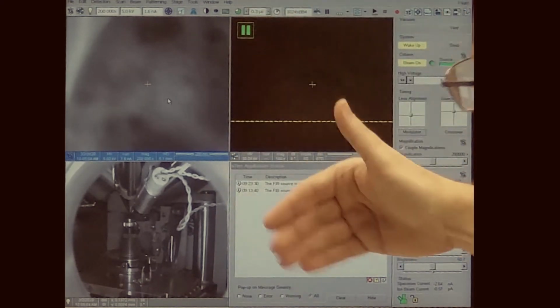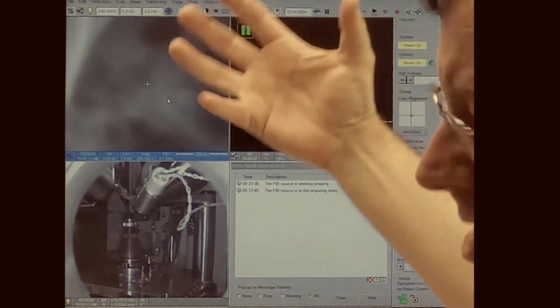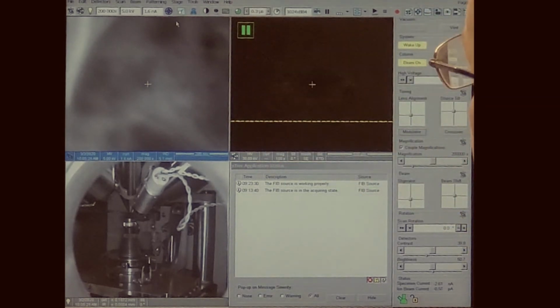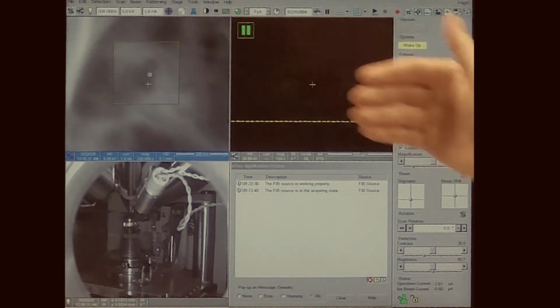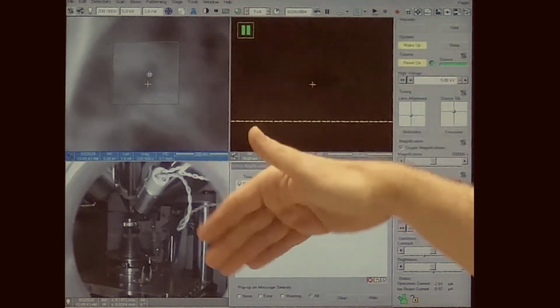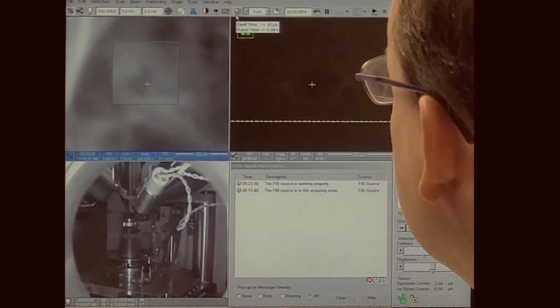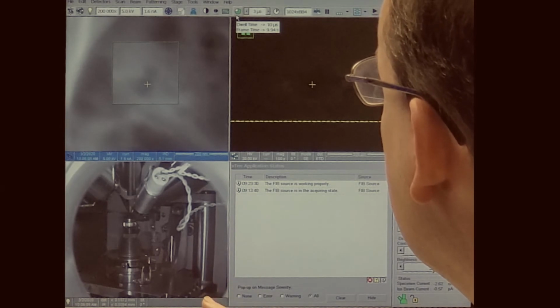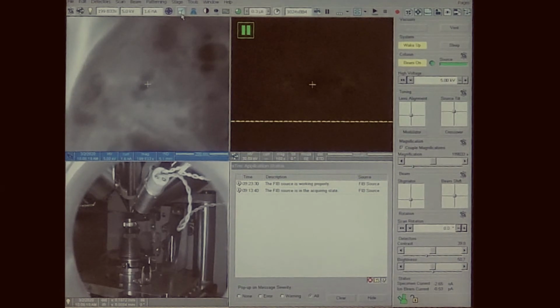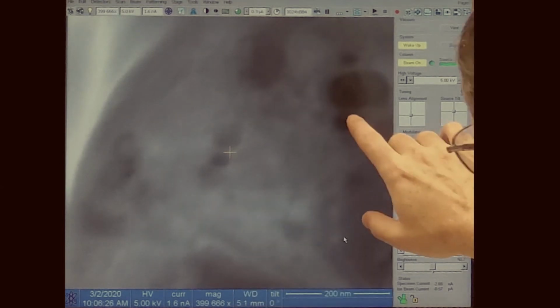Because of the refresh rate that is going on, it is often very difficult to decide, is it better or worse? Up here along the icon bar next to the lens alignment, there's what's called the reduced area. Only the area inside the box is being scanned. This allows you to go to a higher dwell time without slowing down the whole imaging process. Definitely worse, better, worse, worse. We're at 200,000 magnification. If I do the full screen, we're now at almost 400. You can see these holes.